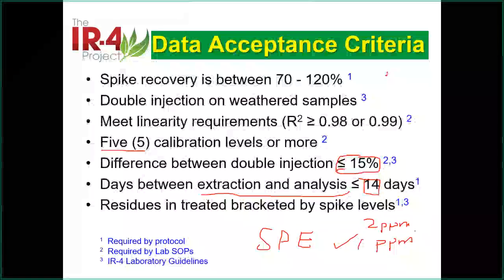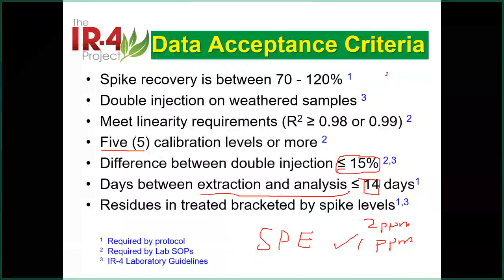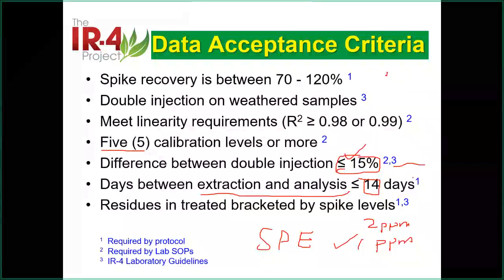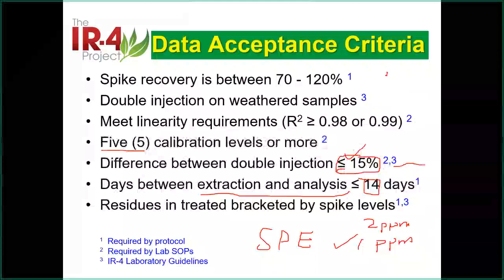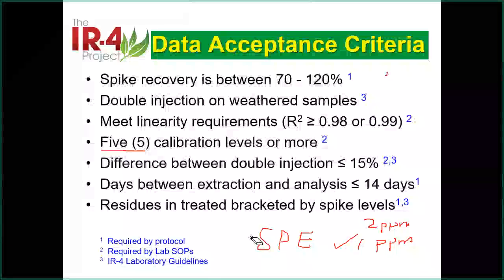Okay, I do see some questions there. In the case where the double injection difference is 15%, what result will you report for both injections? If it is 15%, you take the average. This should be okay because once you have the average right in the middle, your numbers should not be too far away, because your matrix interference will be bigger than your error here in the analysis.